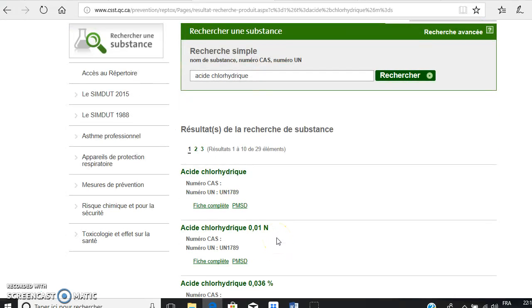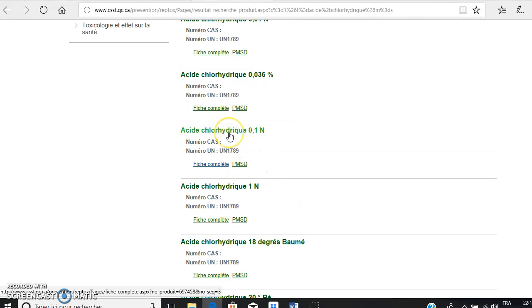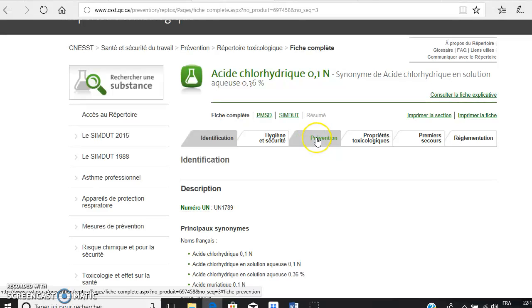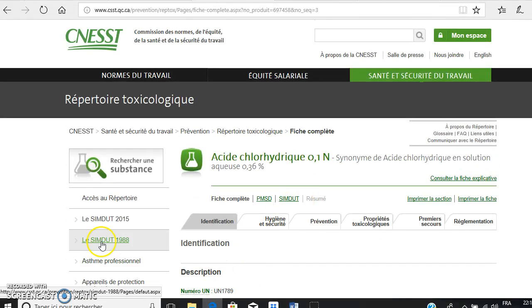So you have many choices, different acid chlorhydric with different concentration. We will choose this one, acid chlorhydric 0.1. Here we have different information about this product, identification, for example, health and safety, prevention, toxicological properties, etc. You can see all this.